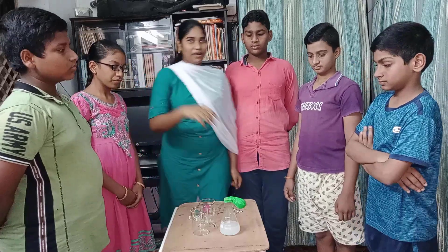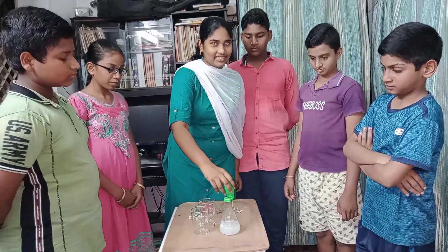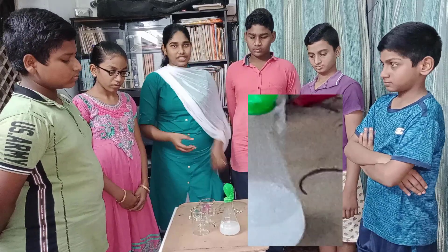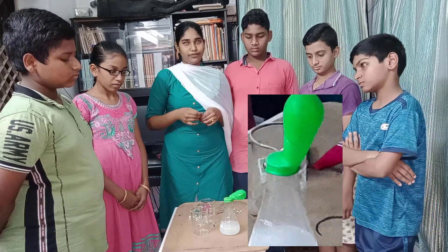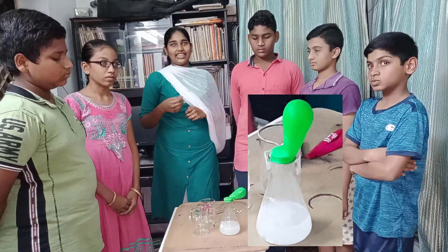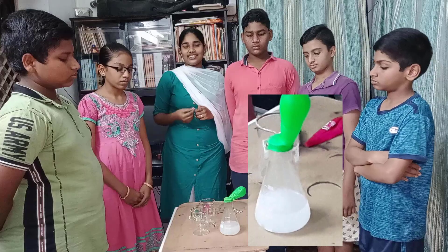Observations: Now we can see hydrogen gas is evolving in the conical flask. It is a chemical change, and the gas is filling the balloon. The formula is: H2SO4 + Zn → ZnSO4 + H2 gas.